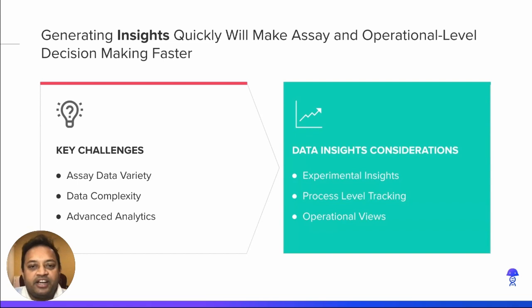Generating insights can be tedious and time consuming in bioanalytical development. Teams are often running a complex panel of plate-based assays and chromatographic techniques. Each of these assays has raw data coming out of analytical instruments, processed analyzed data created by analysts, and final versions of results with statistics and interpretations that need to be recorded or managed.